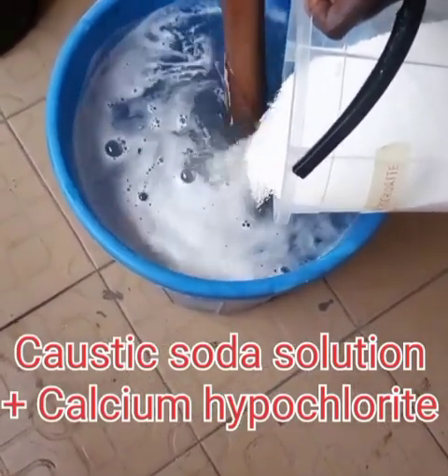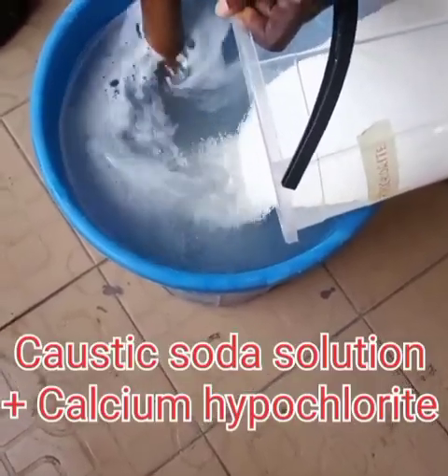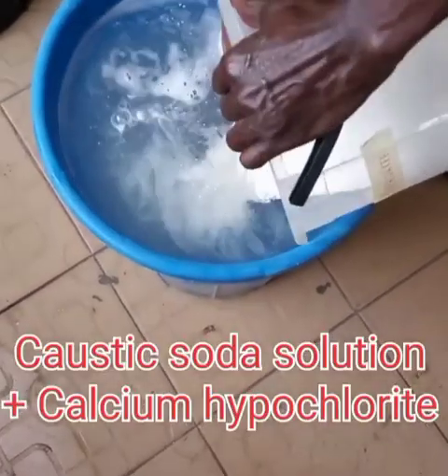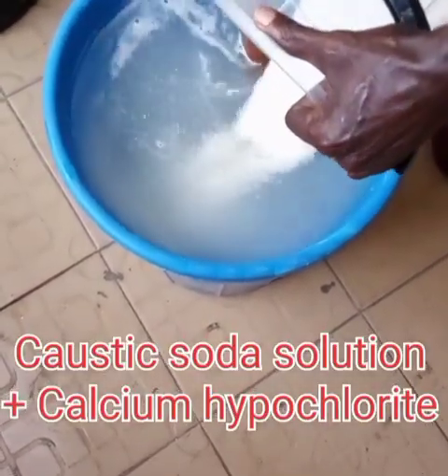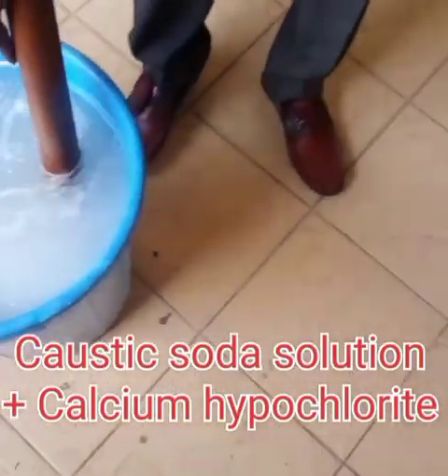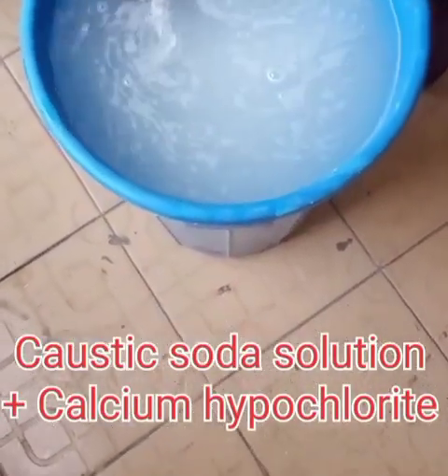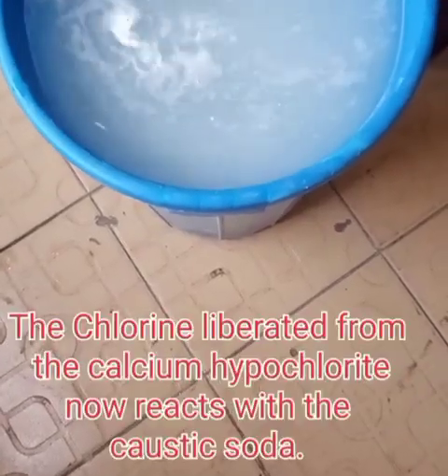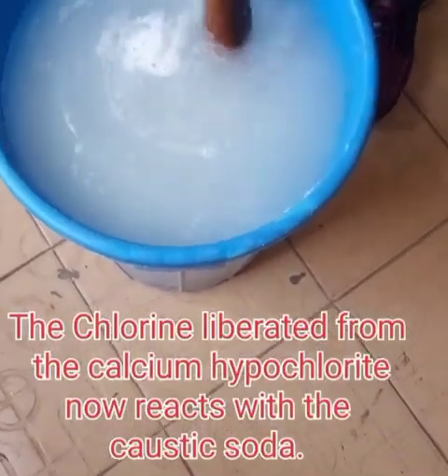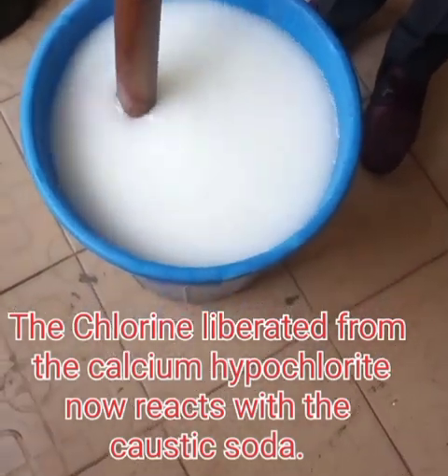When we add the calcium hypochlorite to water, chlorine will be liberated, and the liberated chlorine will now react with the caustic soda in the solution here. So calcium hypochlorite is added to the solution, and you stir. This one will take time to dissolve. You stir for about 10 minutes for everything to dissolve.